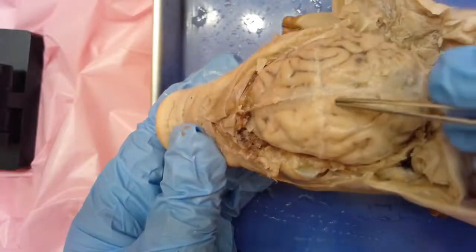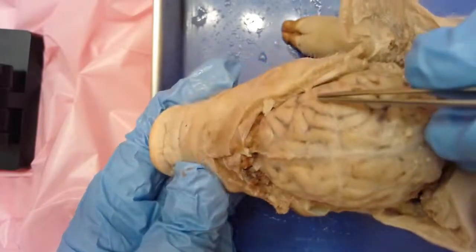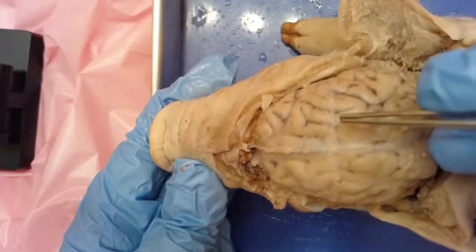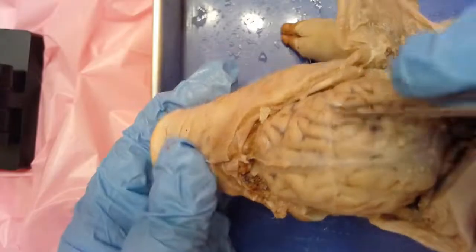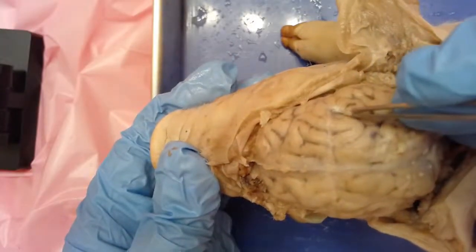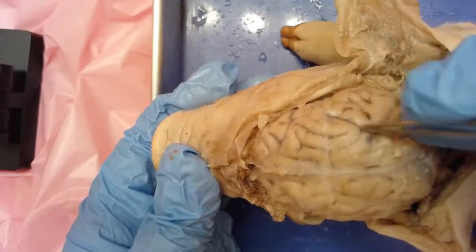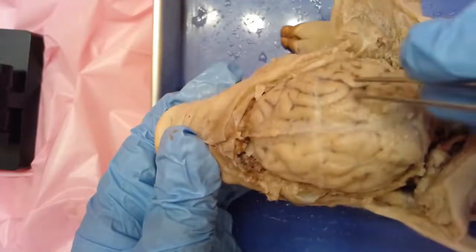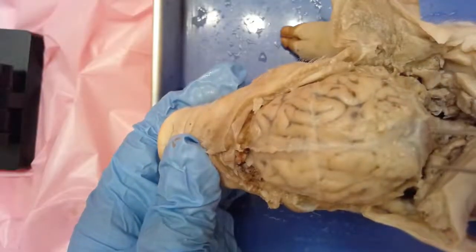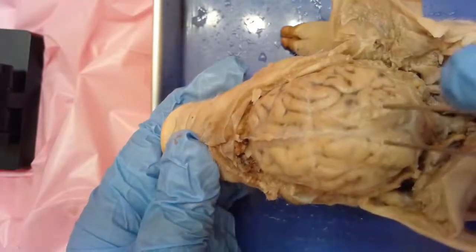Each of these raised areas that almost look like little coils and twists — those are gyri, the raised areas. And then the little valleys in between the raised areas are called sulci. You'll also notice there are little dark areas there — those are blood vessels running all over the surface to supply oxygenated blood for the brain to function.